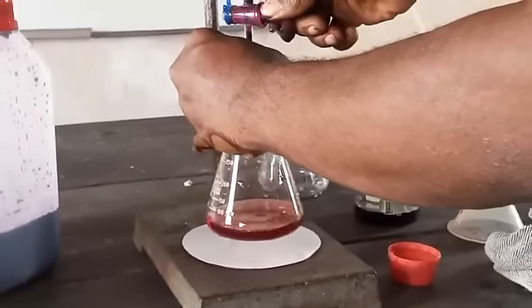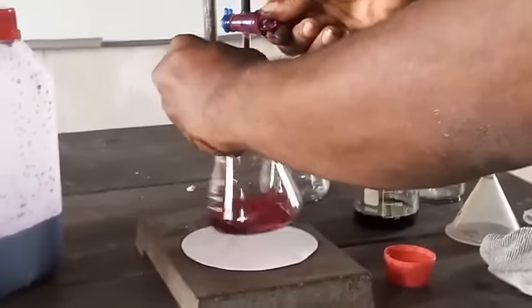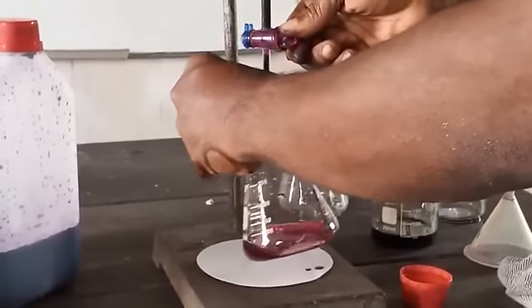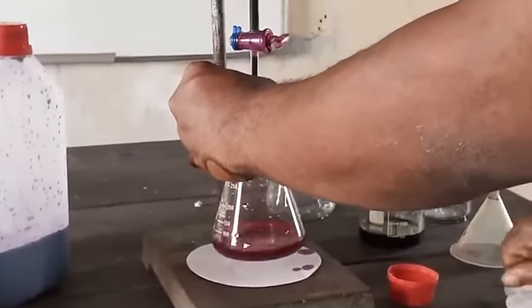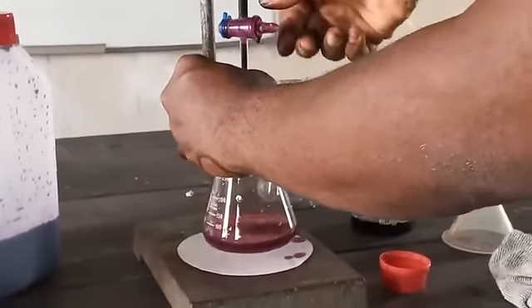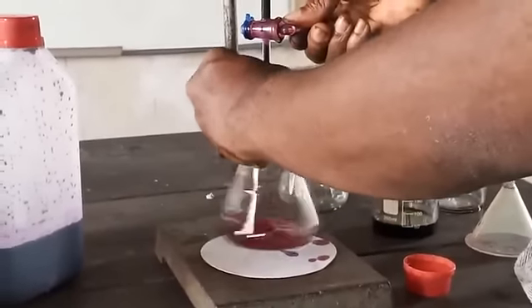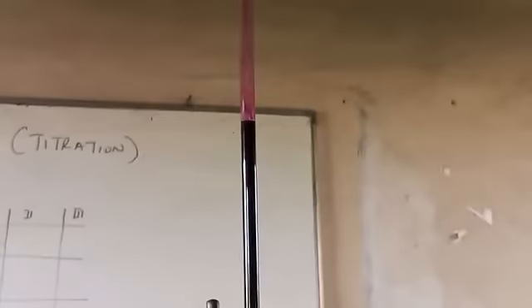One more drop. Add the pink color. That should be okay. One more. That's okay. Okay. So now where I see, that should be 10.50.